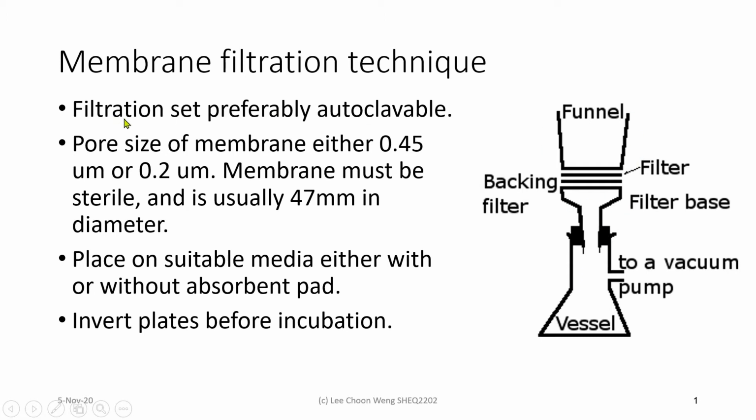Okay, the filtration set should preferably be autoclavable. However, if you are not sure whether it's autoclavable or not, you can clean them with 70% alcohol and then rinse thoroughly with sterile water.